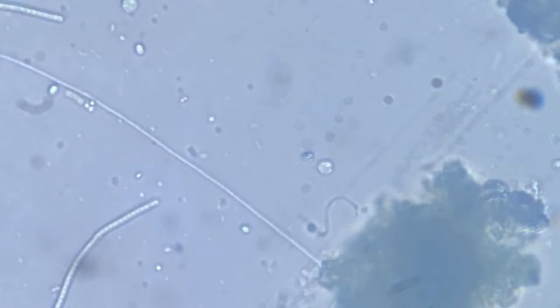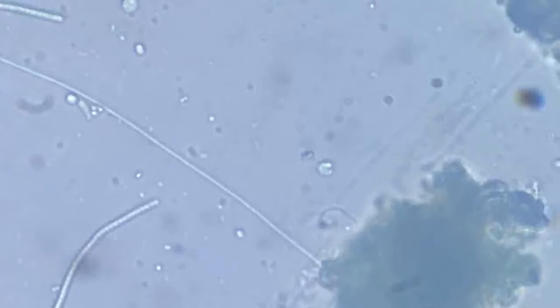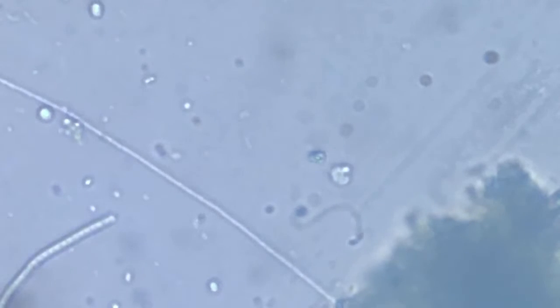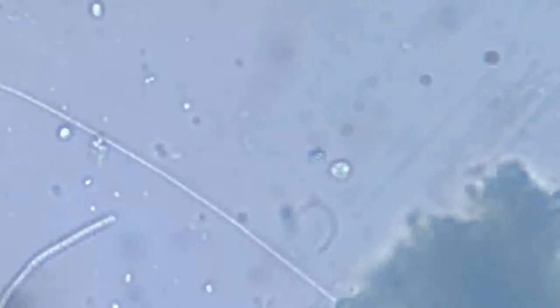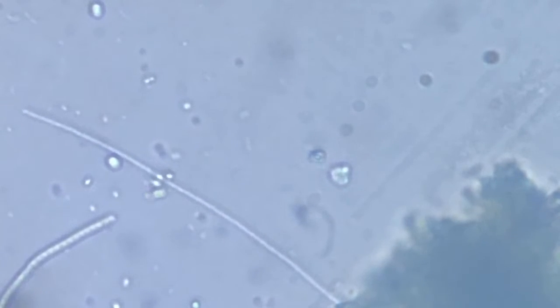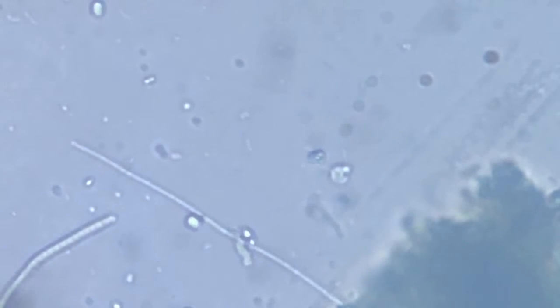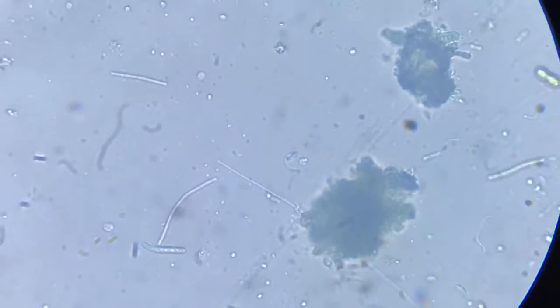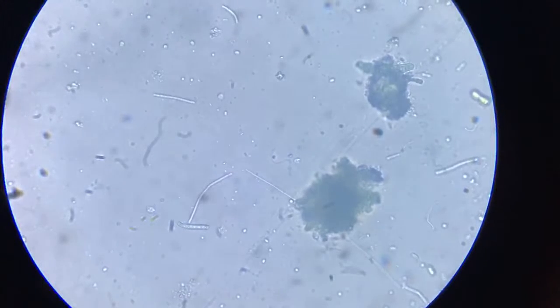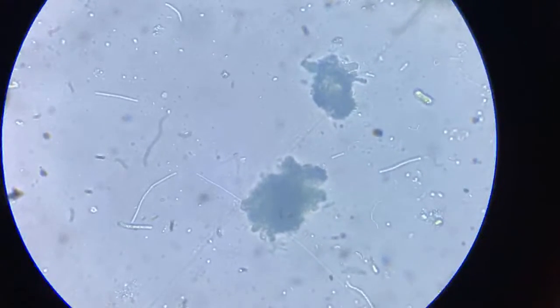Okay, I was trying to give a perspective of the size. You can make an assumption about the size of this animal from the bacteria that is crossing by. Now it's moving, so they can move both ways. This one was moving initially, when we saw this, from 5 o'clock to 7 o'clock direction, and now it's in reverse.